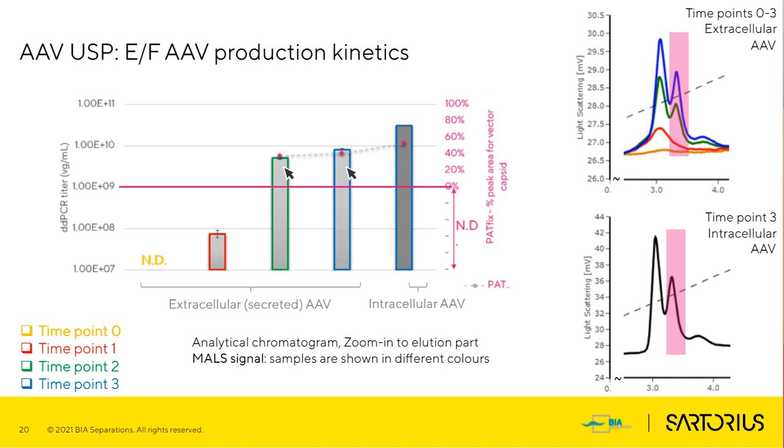What this would allow you is to save the running time of your batch or fed batch or whatever process you're having in your bioreactor. It would allow you to save time. It would reduce the accumulation of your impurities. And overall, it could be a very useful tool that you can use not only for the upstream setup, but you can also use it as a type of control during your bioreactor runs.